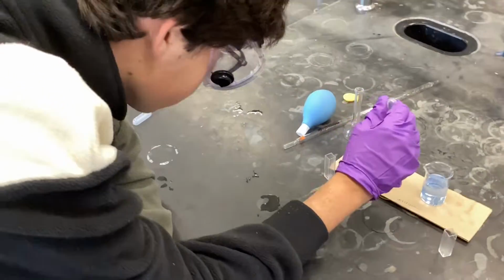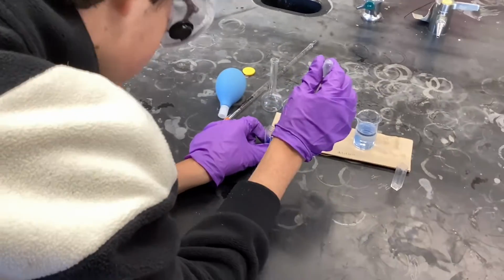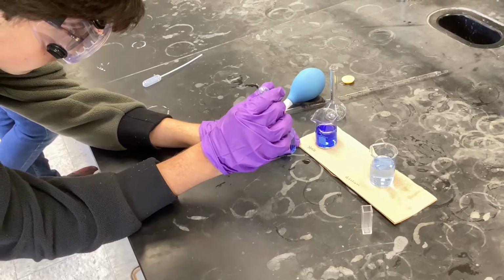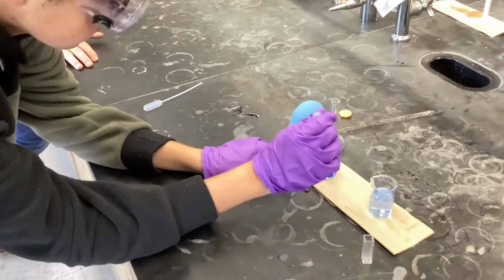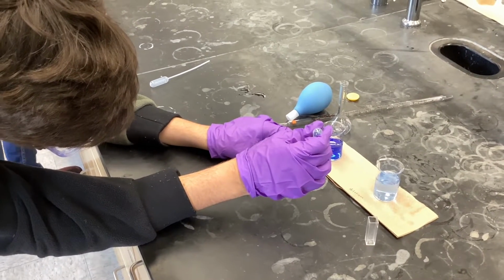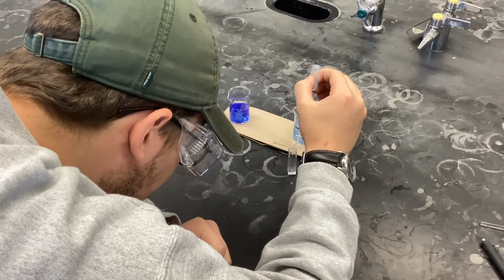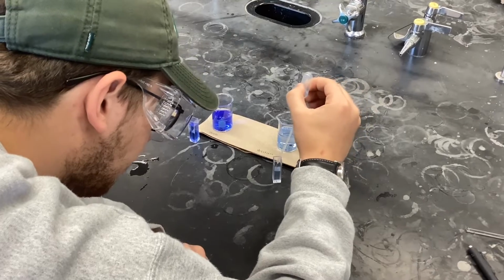In these next two segments, we are moving the unknowns into the cuvettes. We are still making sure not to overfill the cuvettes by adding only up to the line. Now it's time to move to the spectrophotometer room.